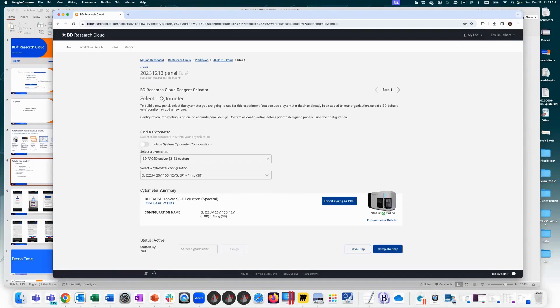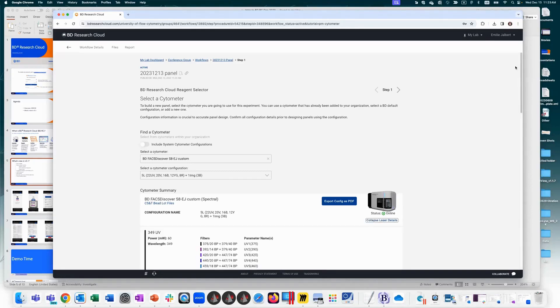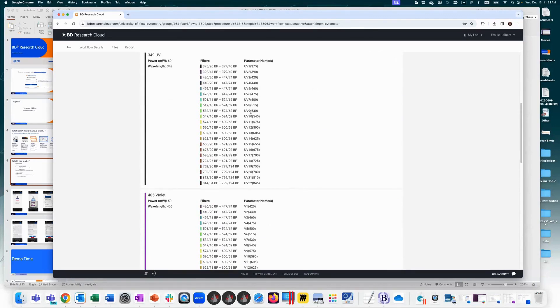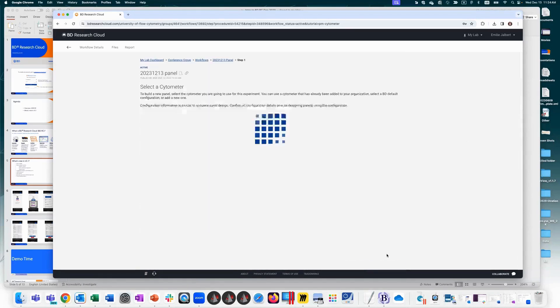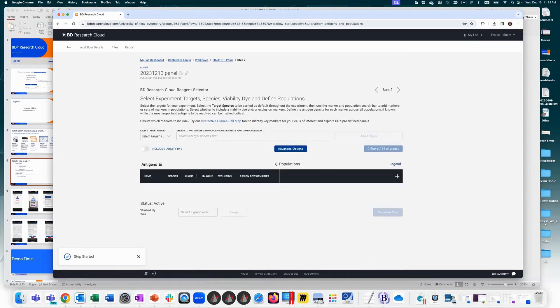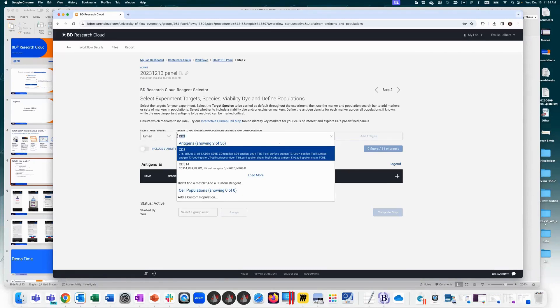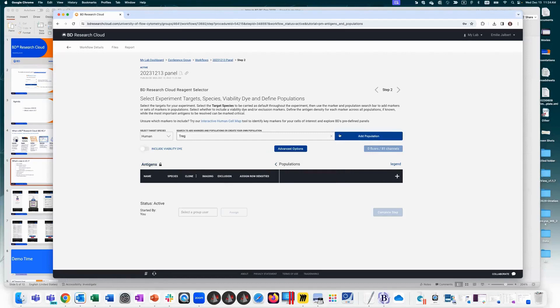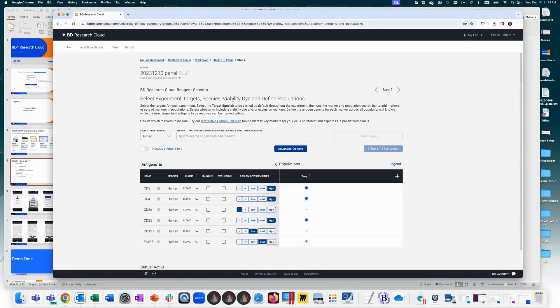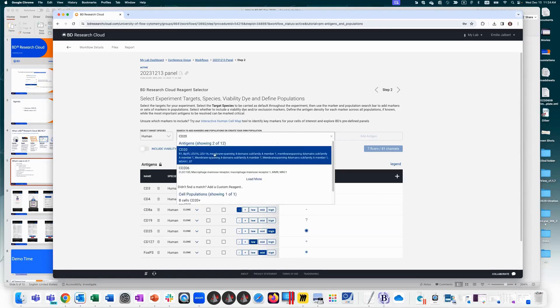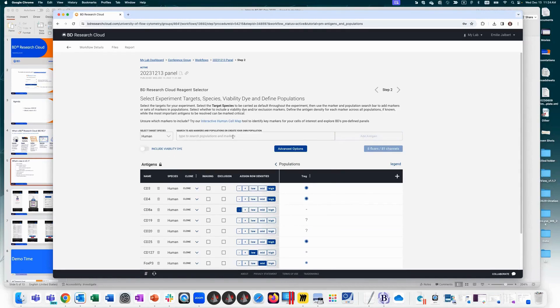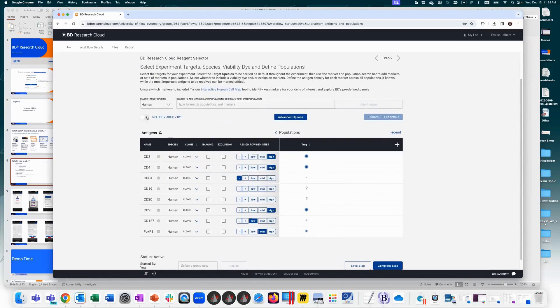Step one is cytometer selection — I'll select the S8 for imaging. You can double-check the cytometer configuration: UV, violet, blue laser, and the additional imaging blue with up to three colors. Step two is selecting targets — choose your species and add antigens one at a time, like CD3, or pull in all markers from a previously created population all with one click. I'll add CD19, CD20, and include a viability dye.